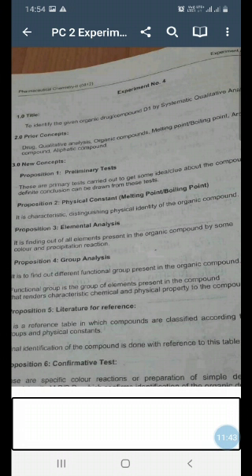Now what you have to do here is, in the general introduction we have seen that the list of compounds is provided by MSBT. So you have to check whether whatever result you have got is a member of that list or not. If it is apart from the list, probably you have detected a wrong compound, because we generally stick to the list which is given by MSBT. So here comes the end of your experiment number 4.